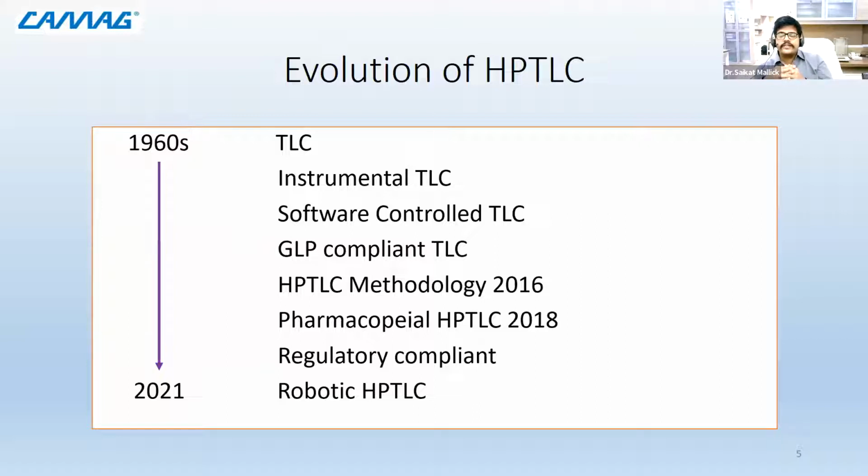And that is why this development started with CAMAG. There were other people also, but CAMAG was dedicatedly focused on developing instrumentation and reviving this technique, because it is a very beautiful technique. I will show you some examples also, where you will realize that wonderful things can be done, and a lot of information can be got out of it as an analytical instrument.